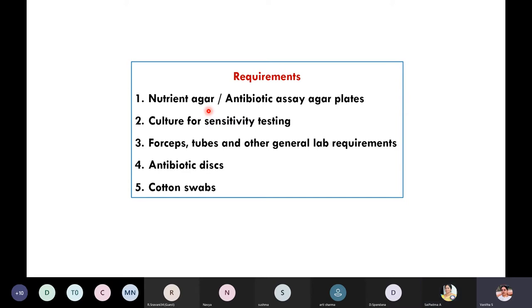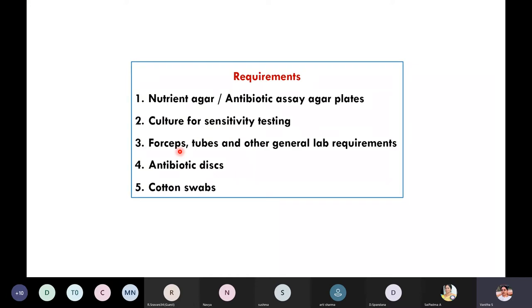The composition of the two media will be completely different. Then you take the culture — the study organism on which you want to test the susceptibility or resistance towards any antibiotic. You will also need forceps and sterile test tubes. Antibiotic discs are commercially available, already sterilized and deposited with a particular concentration of the antibiotic. When handling the disc, you have to be very careful and use forceps.